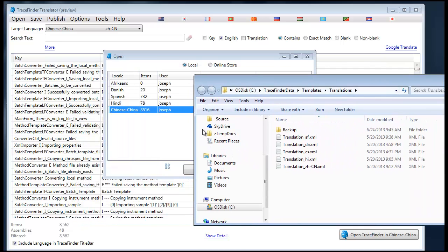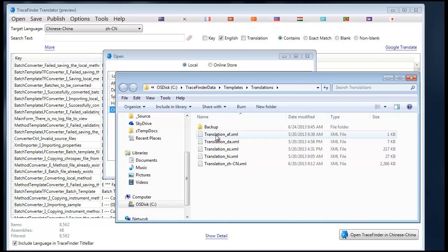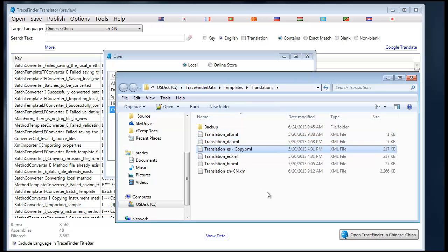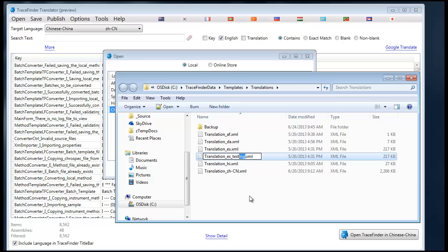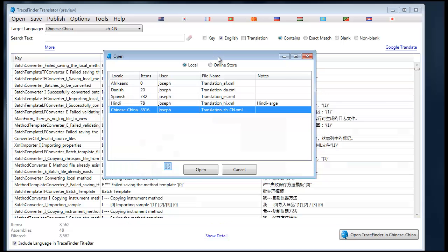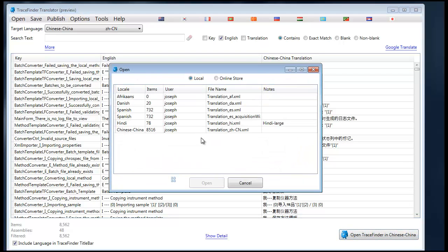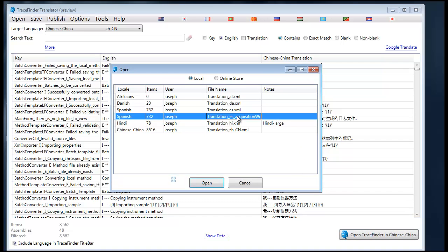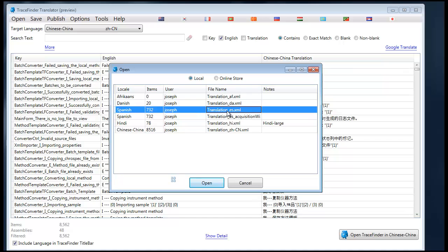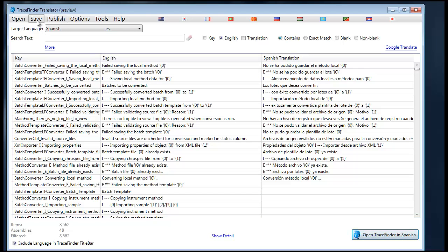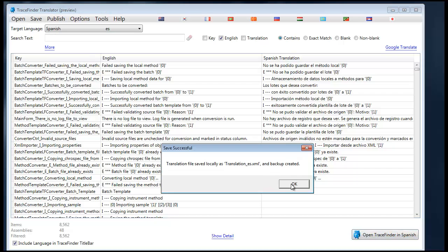If you'd like to open up the folder where these are stored, you can press this little icon in the open dialog. And if for some reason you wanted to create a copy of a language — say you wanted to translate only the acquisition wizard — you could rename the file like such. But notice that when you save a translation file, it always uses the word 'translation' and underscore locale code. You can save a translation file, and when you save it, a backup will be created.